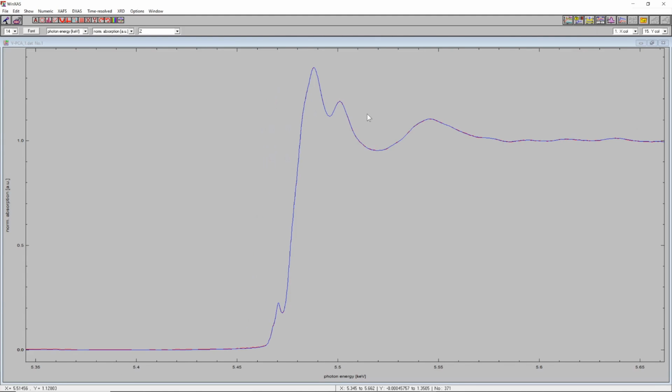So this is the last spectrum now. Shown here is the result of the last refinement. So this is basically only V2O3. After reduction, the result is V2O3, and this is then basically here 100% V2O3 at the end. So now, where are the numerical results? Where is the concentration saved?